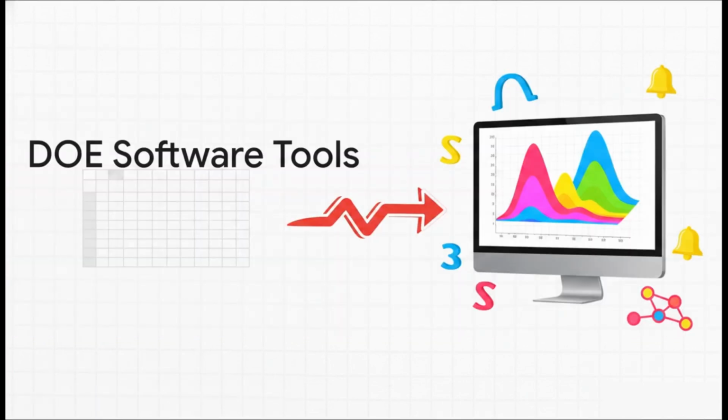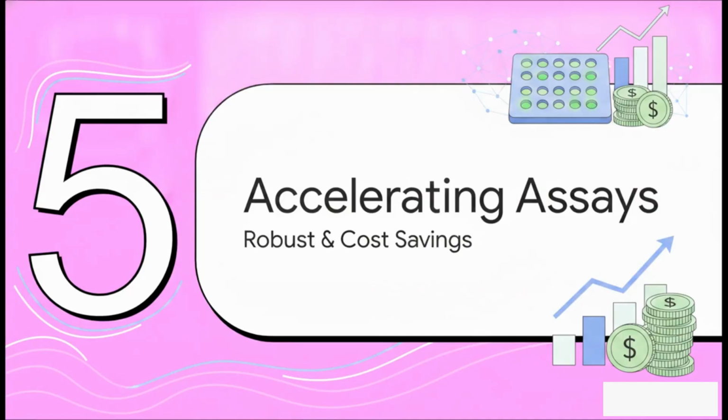You might be wondering, can I just use Excel for this? Well, honestly, standard spreadsheets simply won't cut it for robust response surface visualization. People do often ask if they can still use a checkerboard at all. And the answer is yes, actually. A very broad, sparse checkerboard can still be useful as a quick range-finding experiment. But for true robust modeling, you need dedicated statistical software. The source recommends industry heavyweights like JMP, Design Expert, or Minitab to handle the complex math running behind your assay optimization.